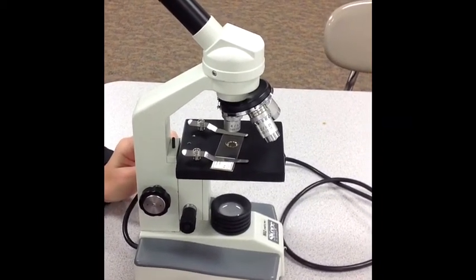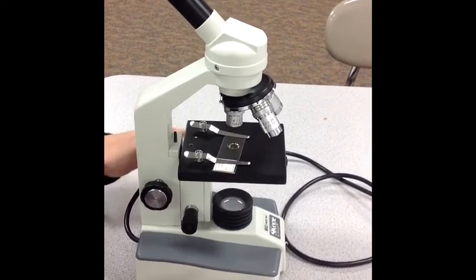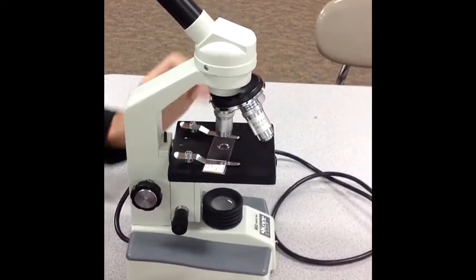If you can't quite see it well enough, you can always put it back down and use a more powerful objective lens.